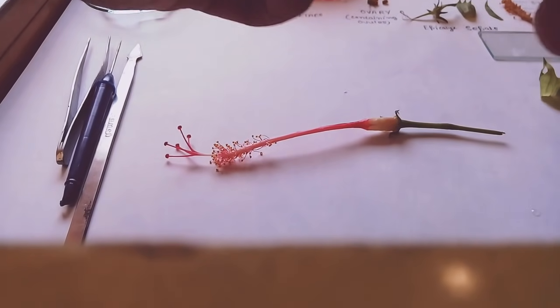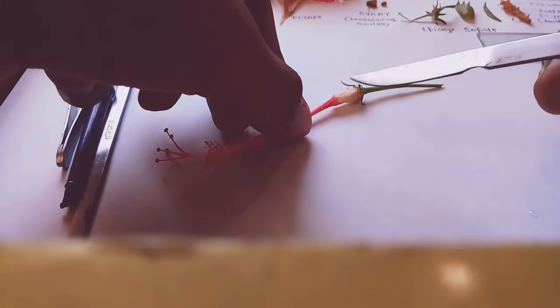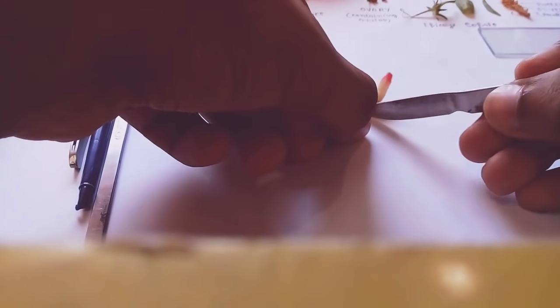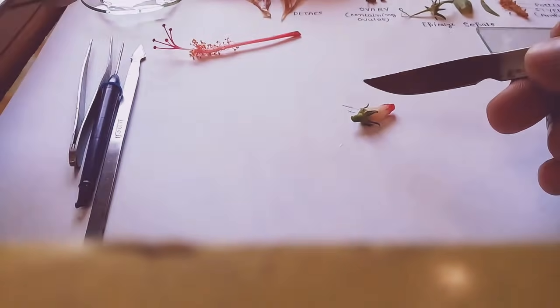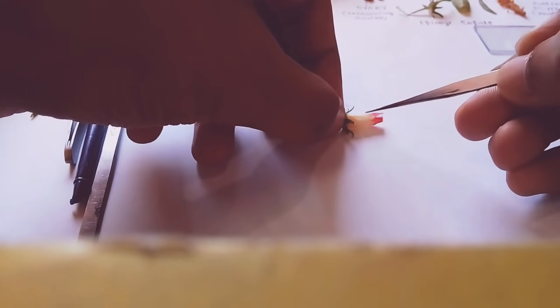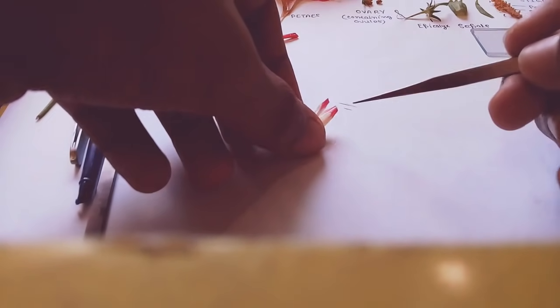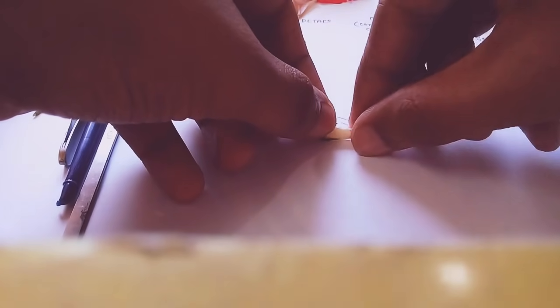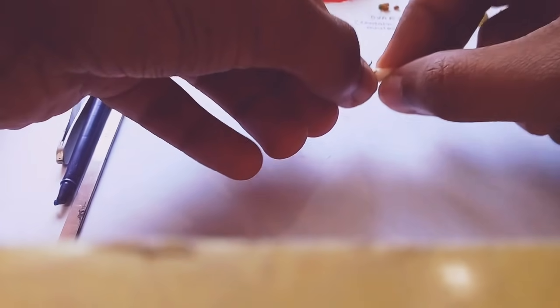To split open, you can directly use a blade or any other tool. As you can see, this part is the epicalyx region, so I'm just cutting it down. We have to split open the style of the flower and remove the ovary from it.